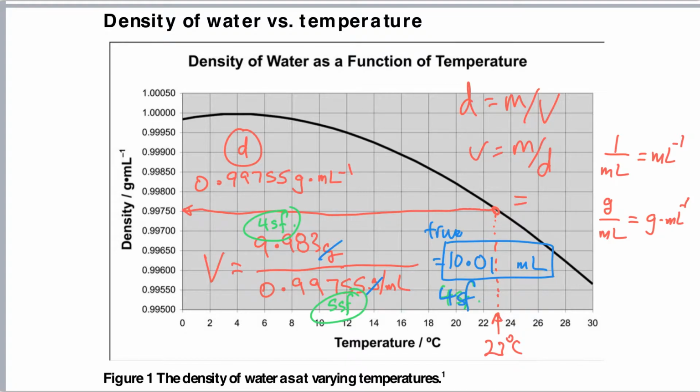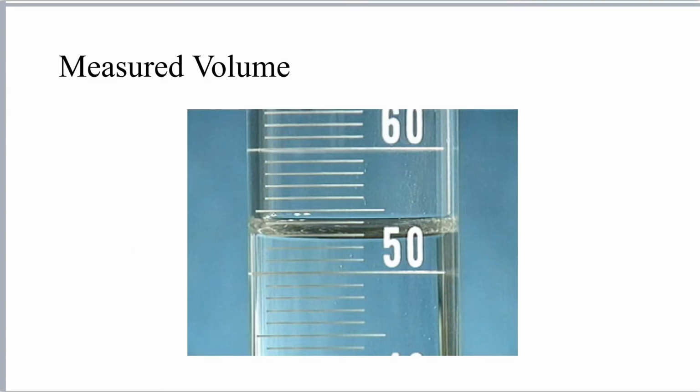Of course, until we make more measurements, we really can't be sure if it's accurate or precise. So we're going to do it in triplicate. So we're going to go ahead and dump the water out of the beaker, and we're going to fill it up again and reweigh it and redo the calculation. And Bob's your uncle, we can turn those masses that are full and empty into a mass of water, and we can go ahead and use the density at the temperature to find the volume, and then just compare and look. So we should talk about reading the volume here.